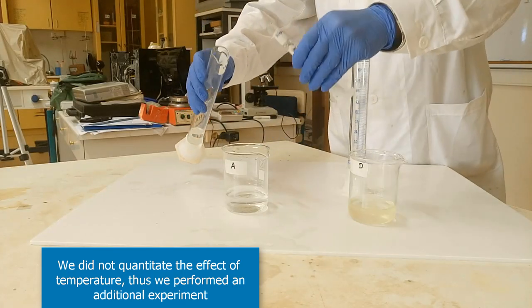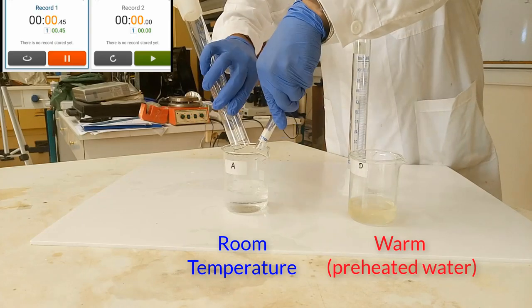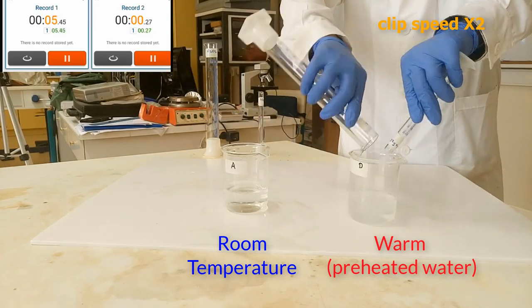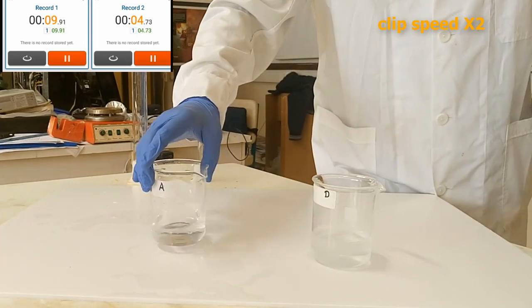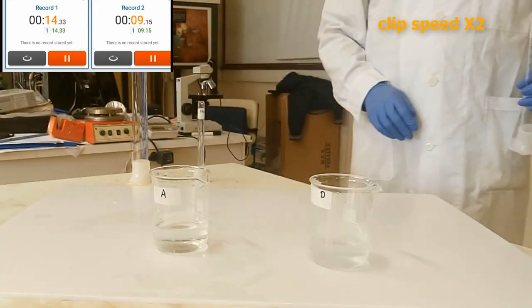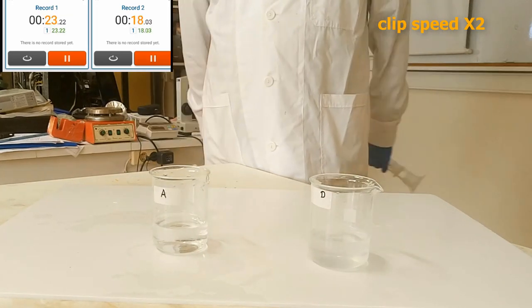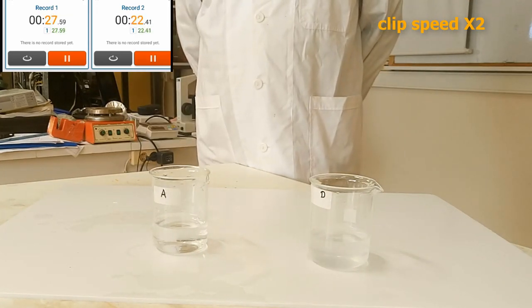In a separate experiment, we quantitated the effect of temperature on the reaction rate. Delivering heat increases the kinetic energy of reactants, which results both in more collisions per time and in higher frequency of productive collisions.